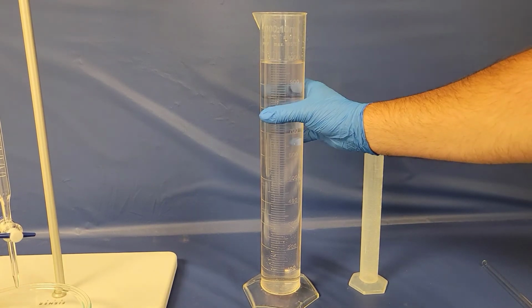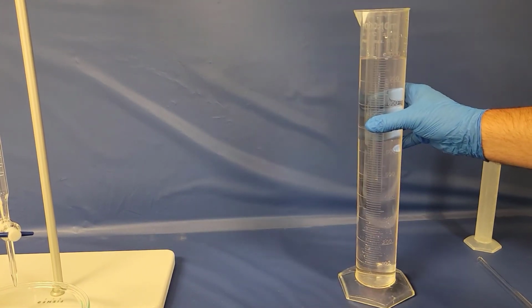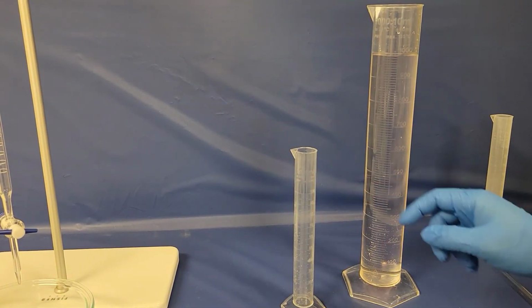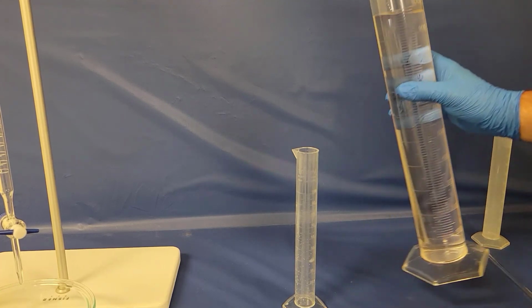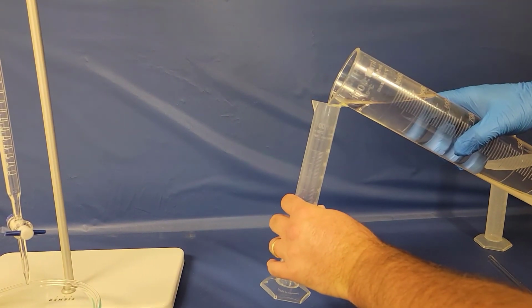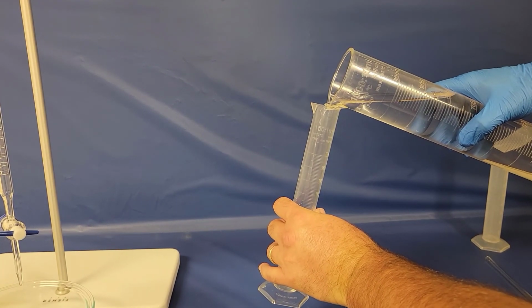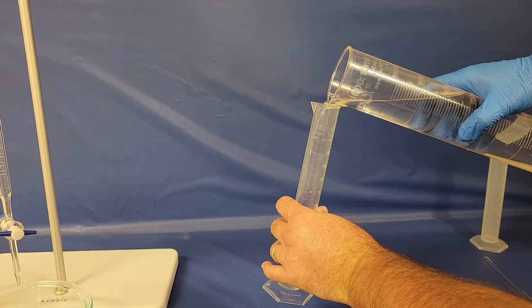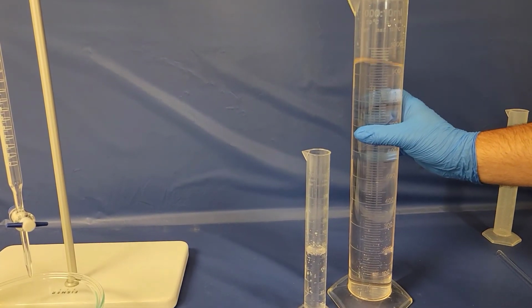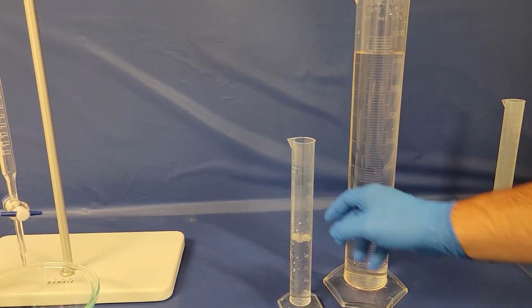So now what we're going to do is take this, let me move this out of the way here, and we're going to mix 50 milliliters of our solution in with more distilled water. So I'm just going to try to pour this into our other graduated cylinder here until we get to about 50. So let's see what we got there. Remember, when you read a graduated cylinder, you always want to read to the bottom of the meniscus.